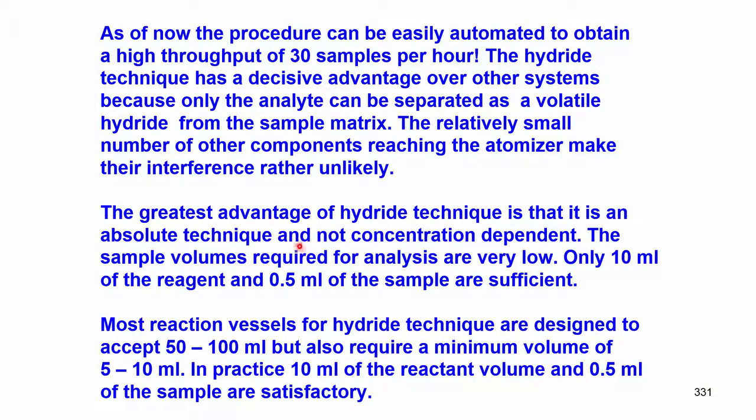So, you can understand the difference between the specificity of this reaction and the beauty of the analysis. It is not concentration dependent and the sample volume required for analysis is also very low.